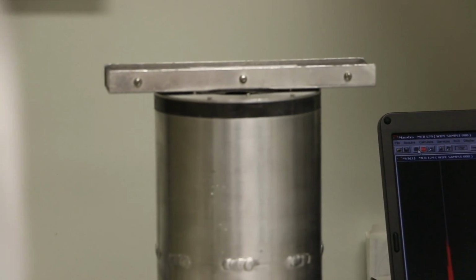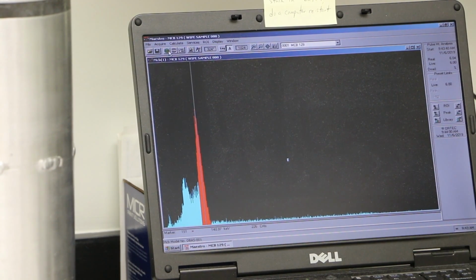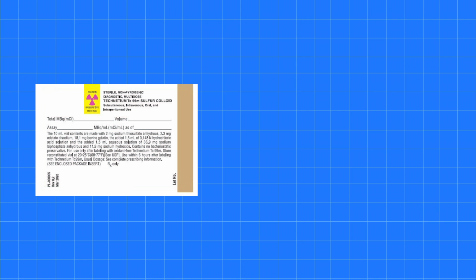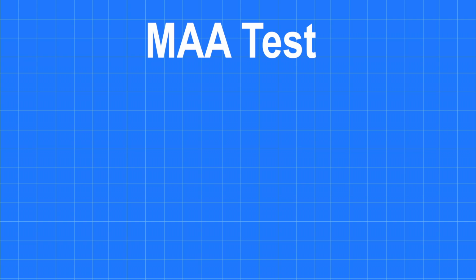Move the test strip so that the solvent front is over the aperture of the well counter. Reset the counter and observe the value. Subtract the value of the impurities from 100%. Discard the syringe, pH paper, and test strip in the hot trash. Radiochemical purity is determined for each vial prepared. The limit for purity is derived from the USP monograph, the package insert, or as specified by the nuclear pharmacist.